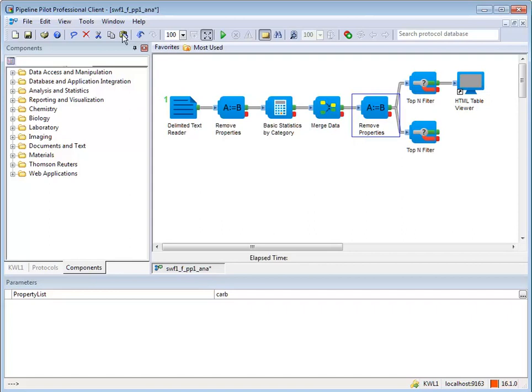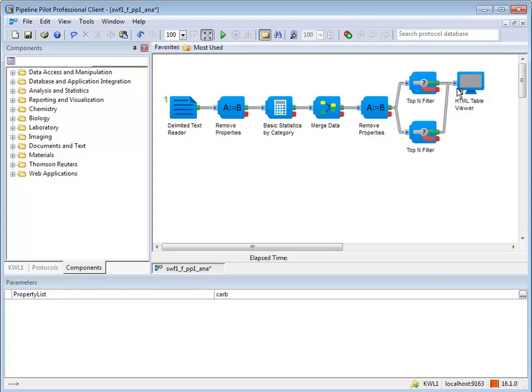Connections can also be made by dragging from a fail or pass port of one component to the input port of a second component. Double-clicking a connection toggles between the pass and fail ports.